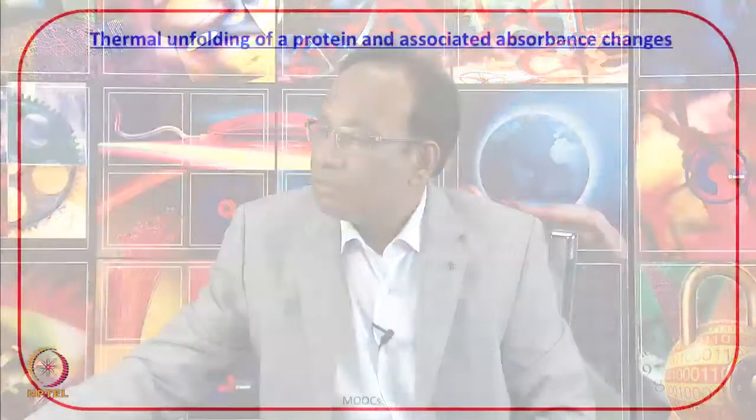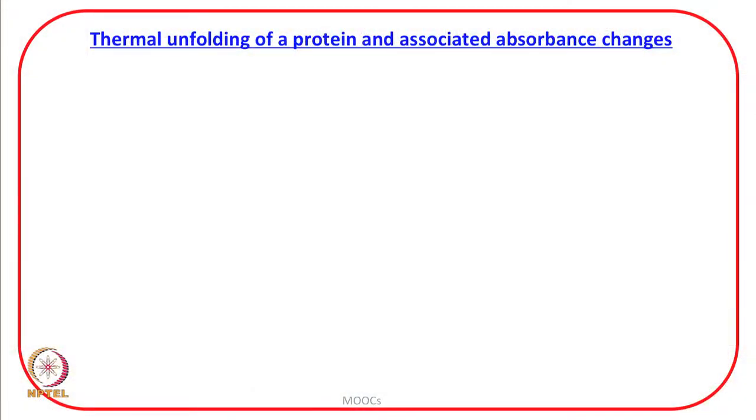Now, let us go ahead and talk about the thermal unfolding of a protein and associated absorbance changes. When a protein is subjected to heat, in other words, when we allow thermal unfolding of a protein, when the temperature is increased, as we discussed earlier, at some temperature there will be cooperative unfolding.